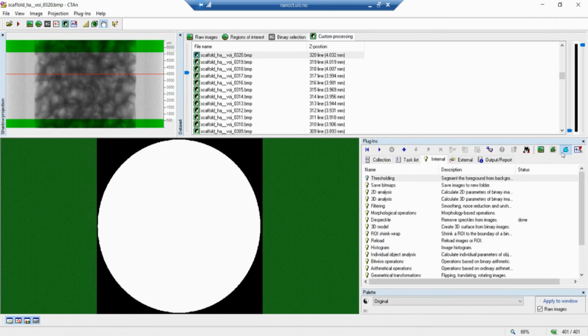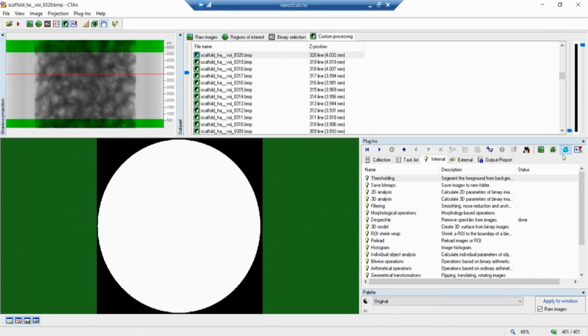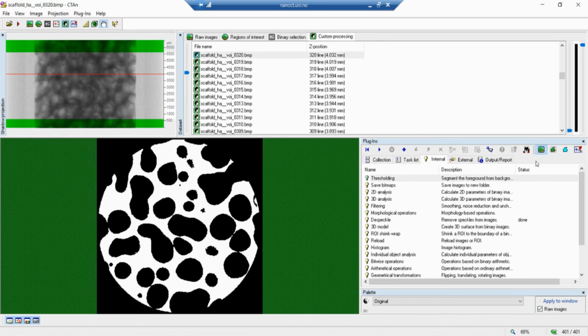Of course, it can be changed based on processes that you can do here. And the image inside the region of interest, in this case here, is going to be the same as the image because everything is inside this part here, this ROI. So this and this are the same for now. Just be familiarized with these buttons so that you are sure that you are looking at the proper or the right thing.